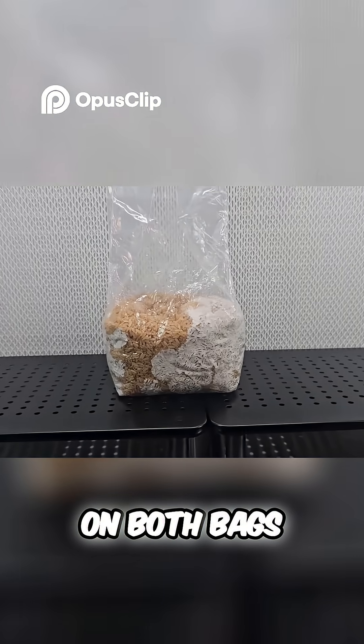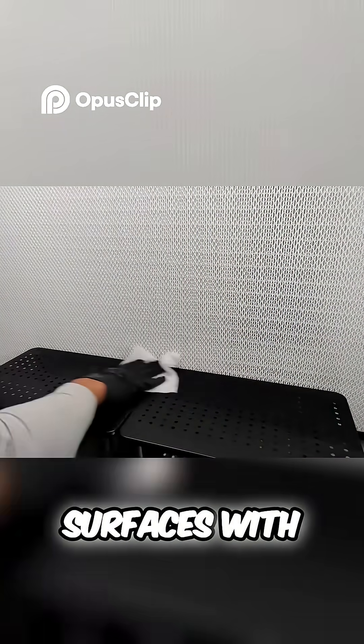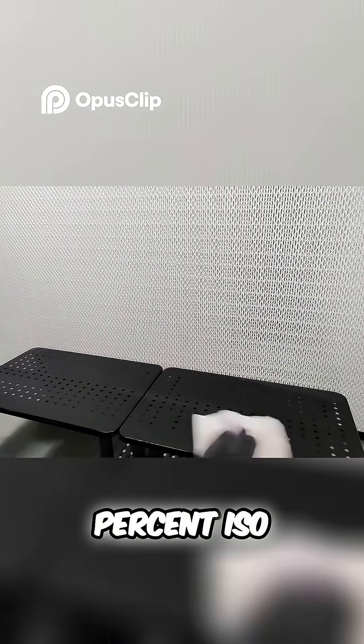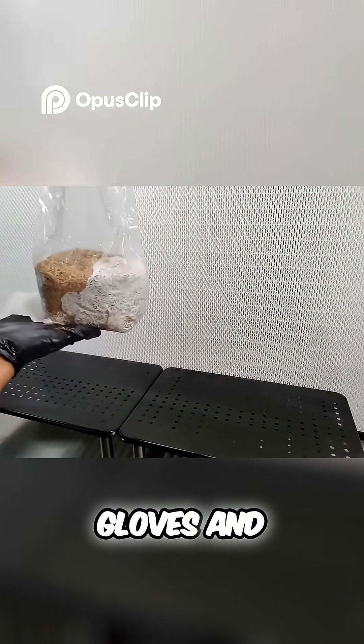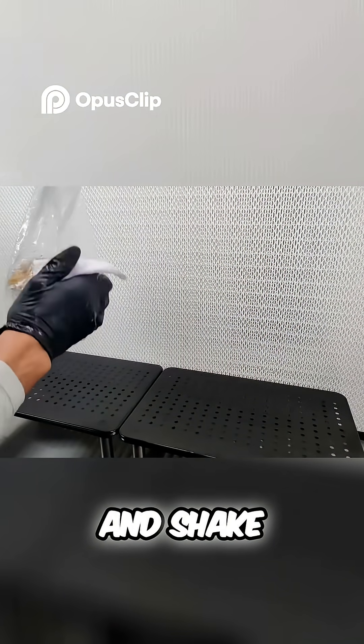So we're going to perform our break and shake on both bags. You guys already know we prep our surfaces with the 70% iso, gloves, and bag, as well as prepare for our break and shake.